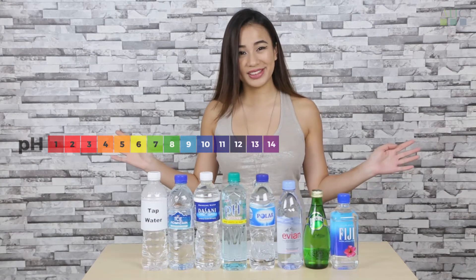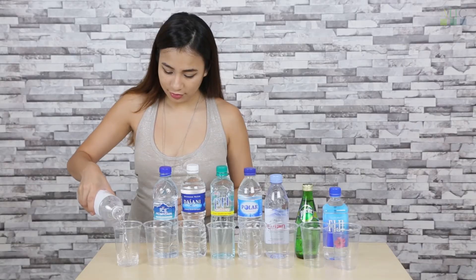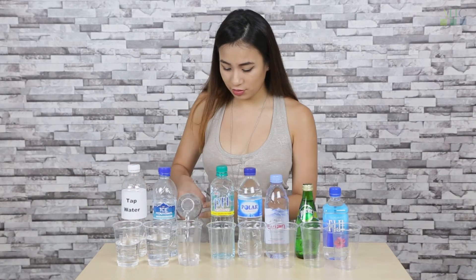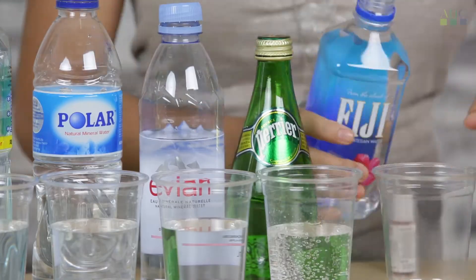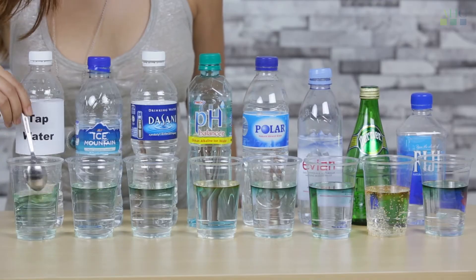So let's see how this goes. I'm laying out the plastic cups now, and I'll be pouring water from the different bottles. I'm using the pH dropper now to test out the different pH levels from each bottle.